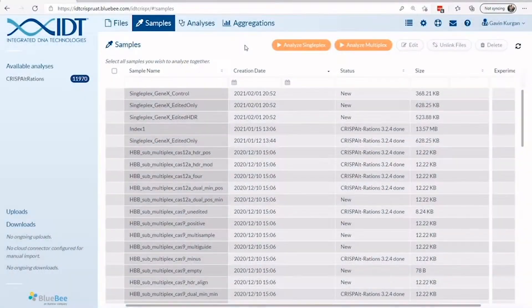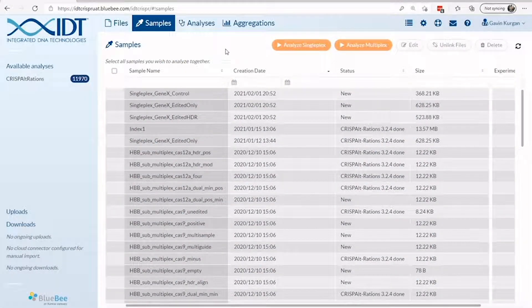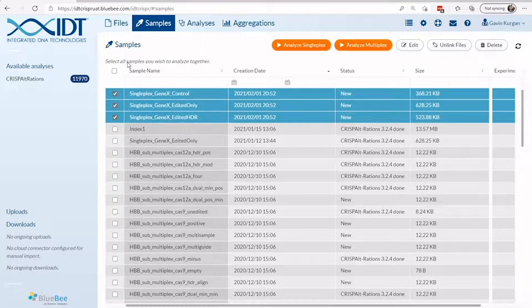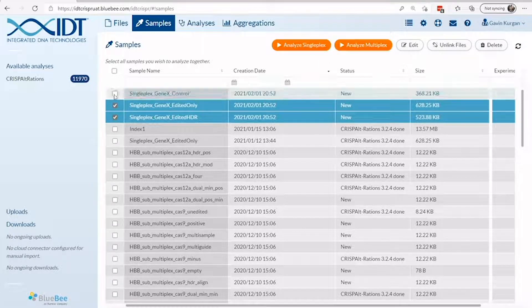To make the most of the RAMP-C CRISPR analysis tool, we'll show you how to analyze a singleplex experiment to screen on-target guides and conditions. First, you need to select your samples. Let's navigate to the samples page.